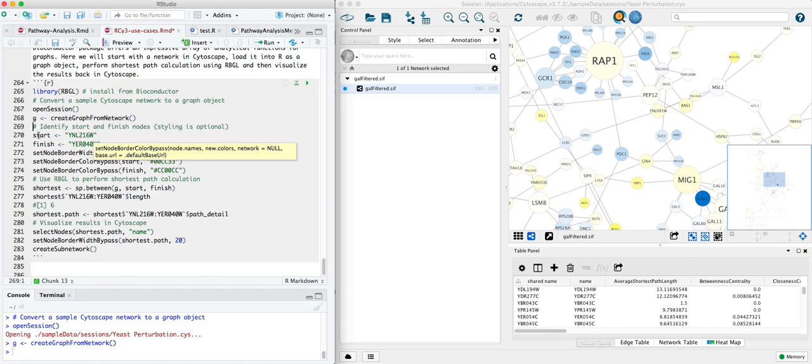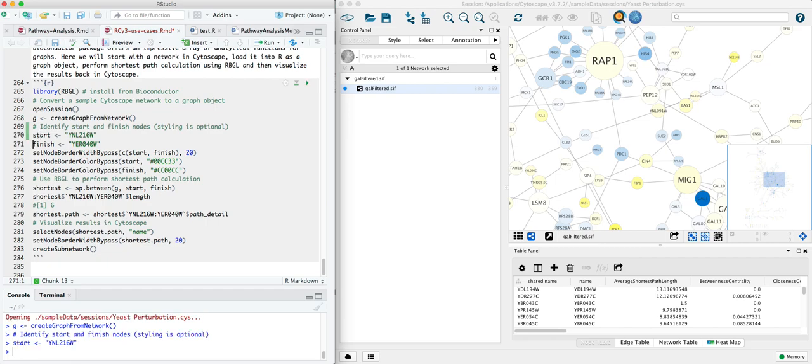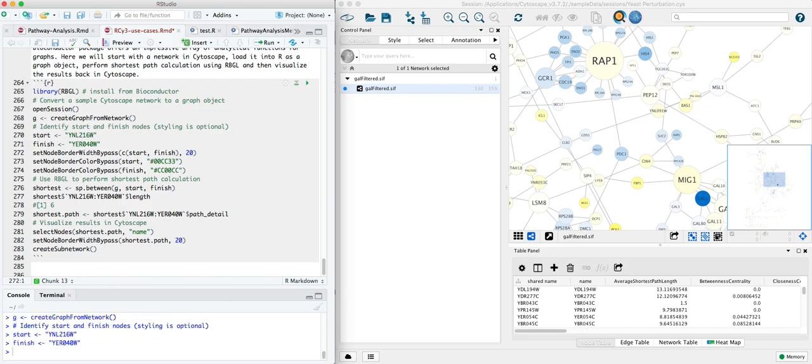We're going to define a start and a finish for our shortest path calculation. So we're just picking two of the nodes that are in our Cytoscape network here, picking them by name.